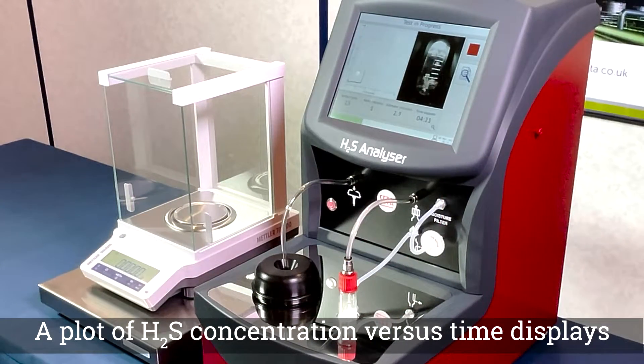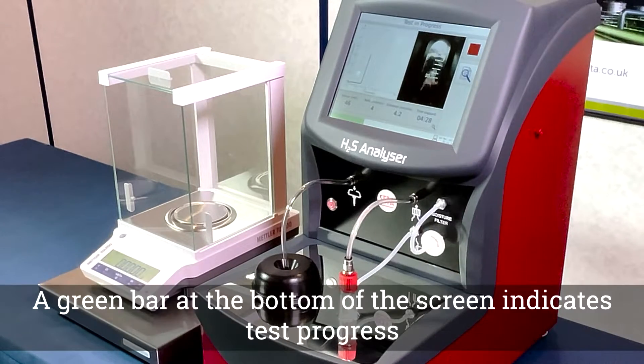At the three minute mark, air will begin to bubble through the test vessel and the graph will display the H2S content along with a test timer and live test values.